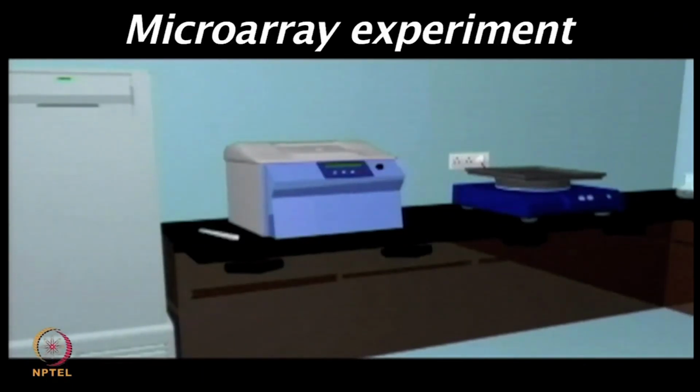So, let me give you an overview of various steps involved in performing a protein microarray experiment. I will show you how human proteome chips can be used for screening the biomarkers by using human serum. Now, as I mentioned, the same overview, the same steps, can be performed for various types of applications.